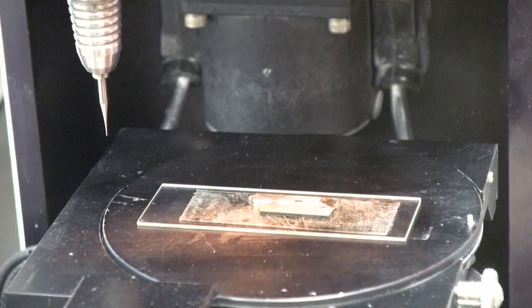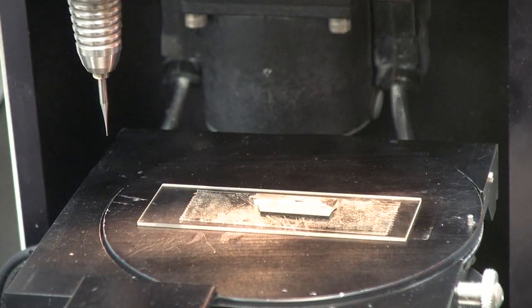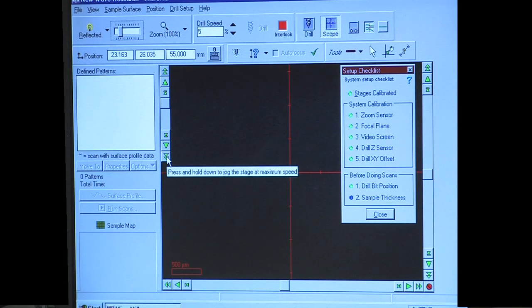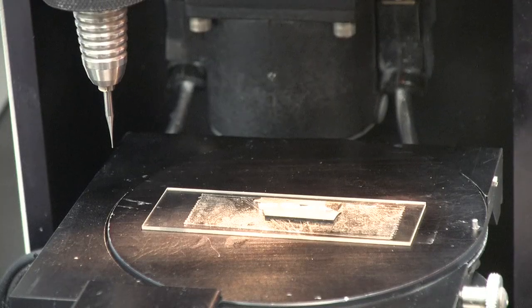We use the reflected light source when sampling otoliths and the controls can be found in the upper left of the screen. Adjust the light to an appropriate level and manually move the Z stage down closer to the sample until it is in focus.